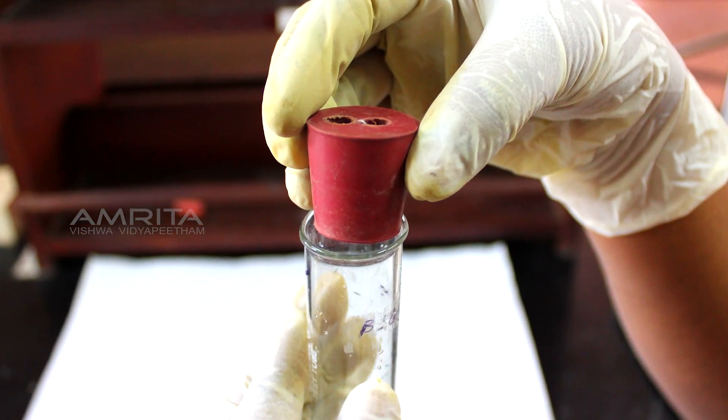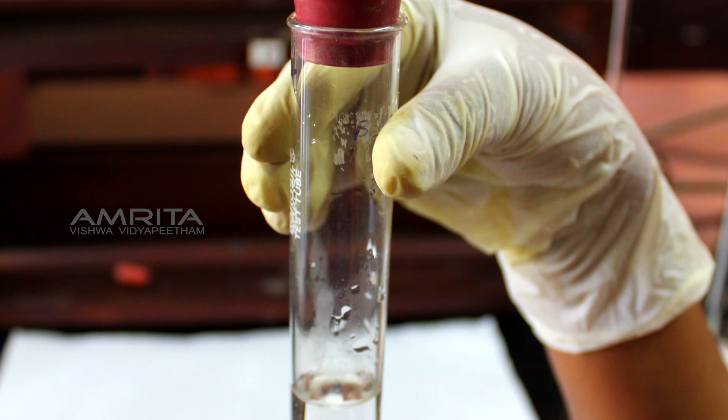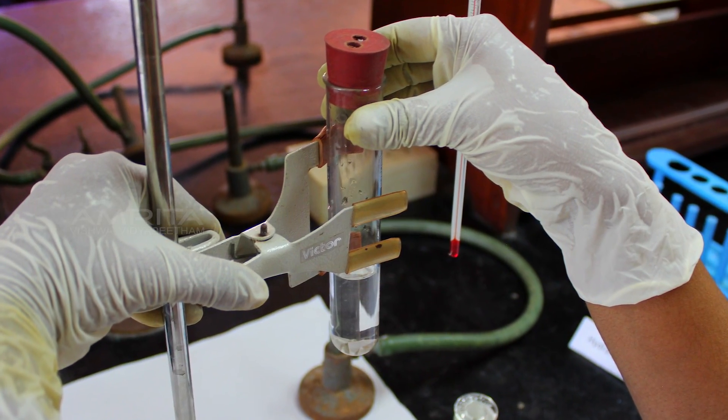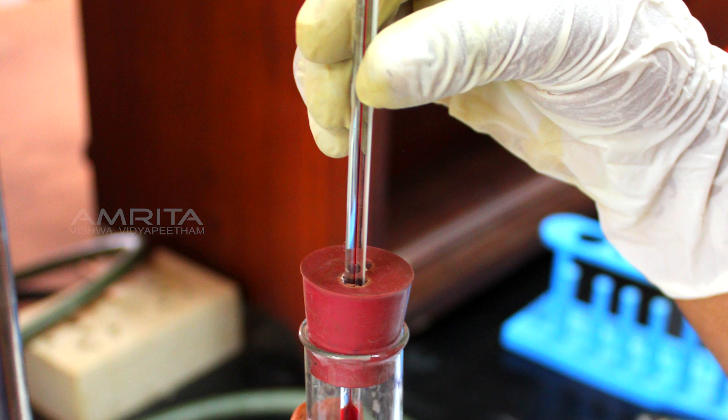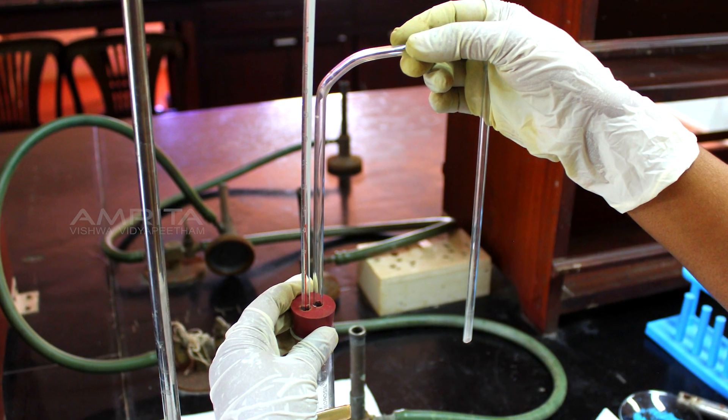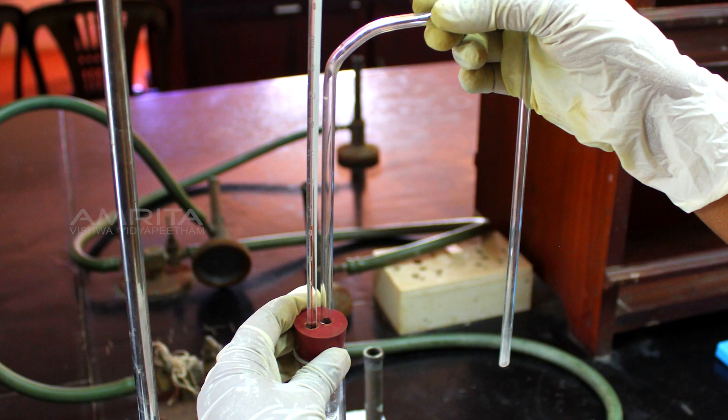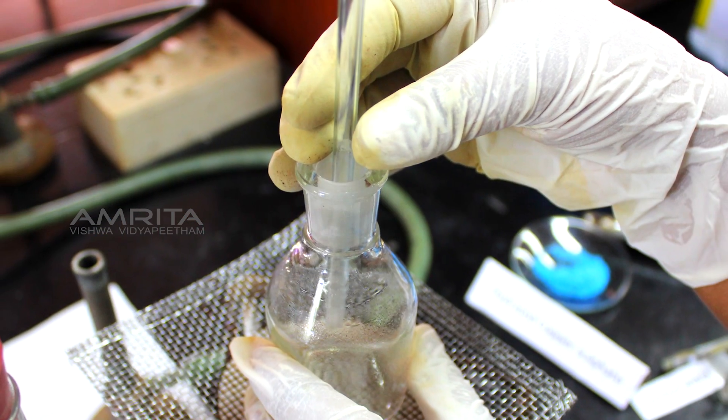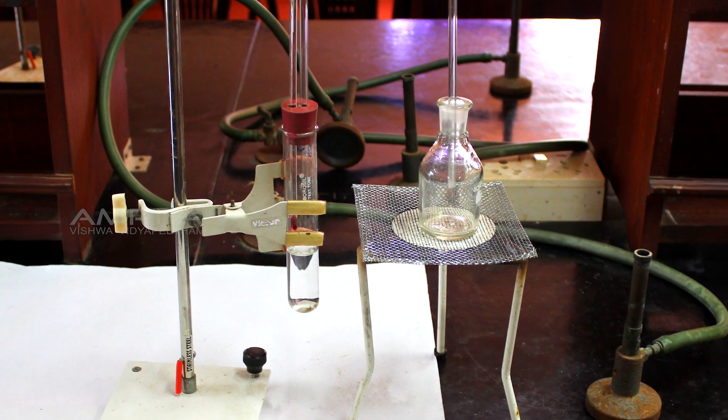Fix a cork with two bores in the mouth of the boiling tube and clamp the tube to the stand. Insert a thermometer through one of the bores of the rubber cork and a delivery tube through the other bore. Insert the other end of the delivery tube in a bottle to collect the condensed water.